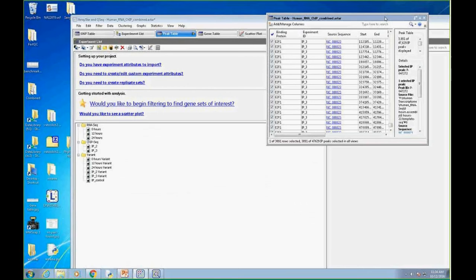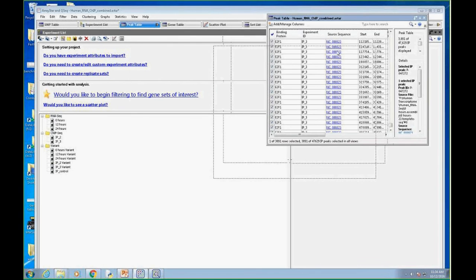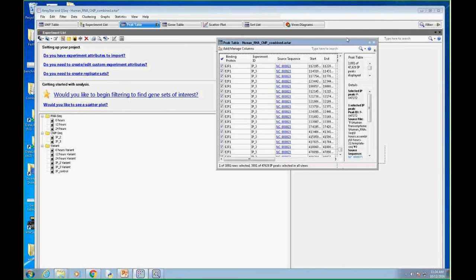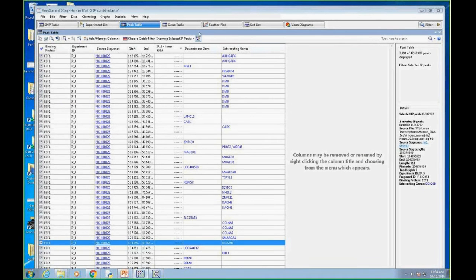And let me get this view how we want it here. Let's see if I'll try to dock it here. Come on. View. Okay. And so we'll start here with the experiment list.